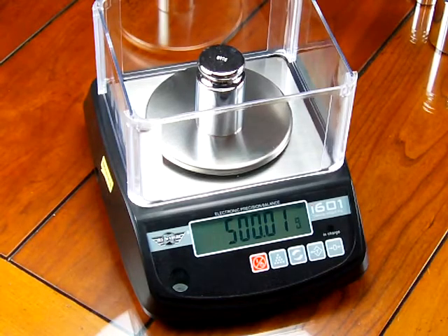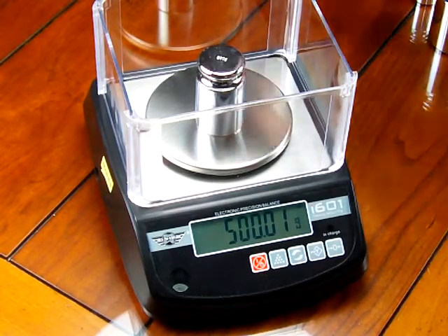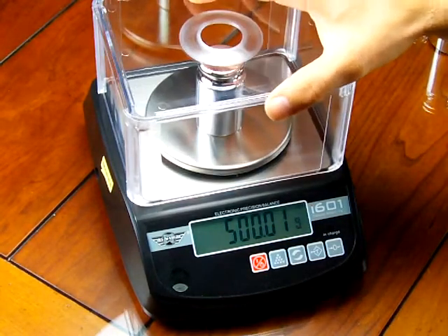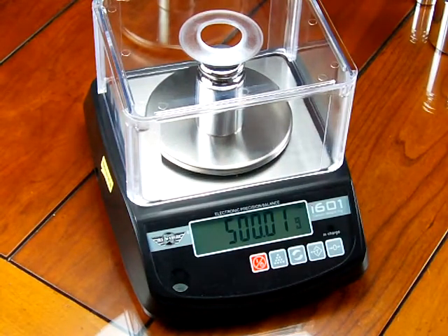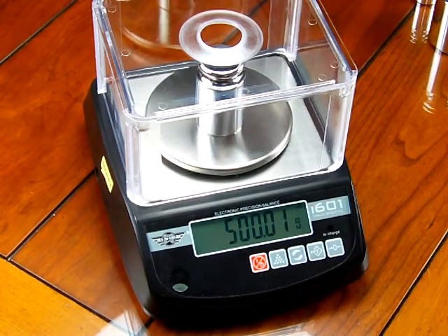Now the reason why it has a windshield is air turbulence can go underneath the platform for any scale that goes to .01 gram readability. So, this scale comes standard with this draft shield. It's all made out of plastic, and again, please consider the price point that you're buying at.